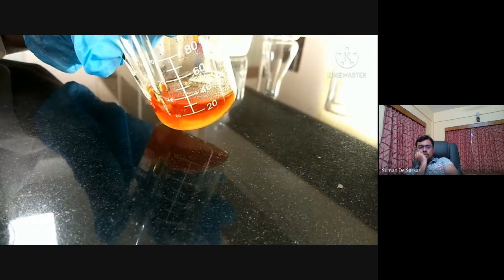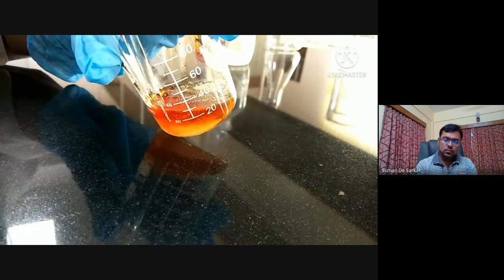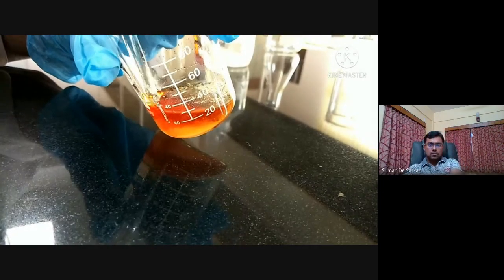You can see from this scratching point, more and more precipitate is coming. So we'll continue this and allow all the product to precipitate out from the solution.